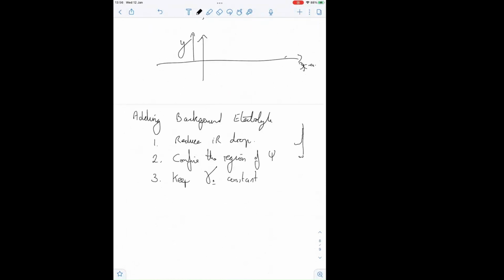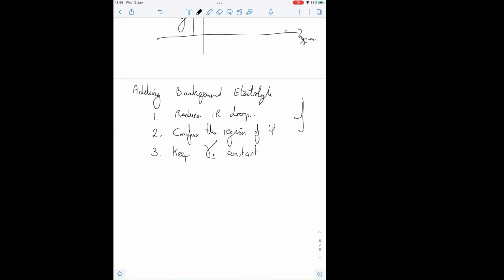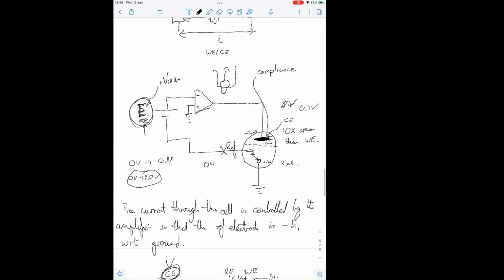Hi. I've got a question regarding the proper grounded potentiostat. What can we see on the software on the monitor if the potentiostat is not properly grounded? Okay, that's good. If you look through the manual, somewhere in the software, typically, and it'll depend on how much you've paid for your potentiostat, you can actually choose to float the potentiostat.